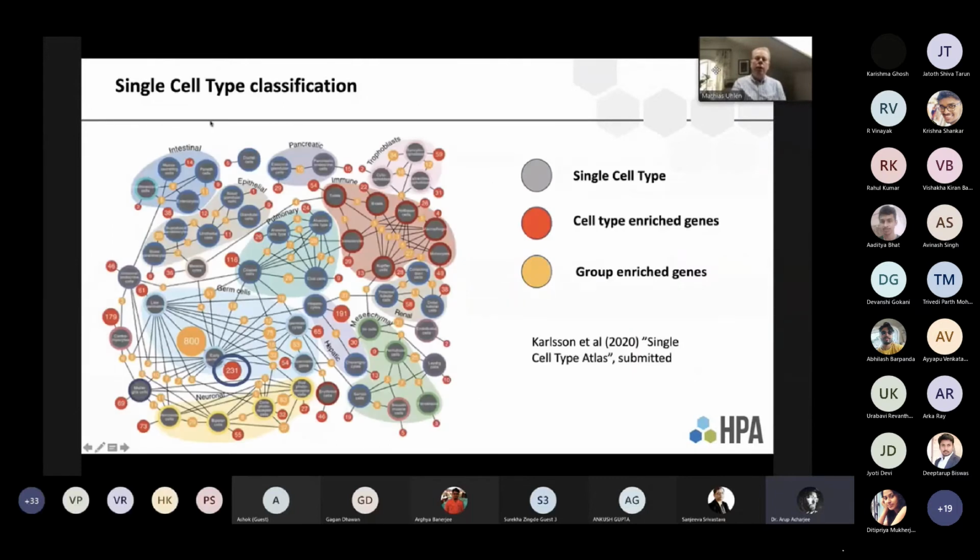You can also go in and look for the classifications. So here, for example, we are showing all the tissue-specific or cell type-specific proteins. And we can, for example, see that there are 231 proteins which are specific for early spermatids in the germ cells. And there are 800 proteins which are shared between late and early spermatids. And then you can click on this bubble and then you can see what proteins it is. And I hope that you all can go and do this kind of analysis.